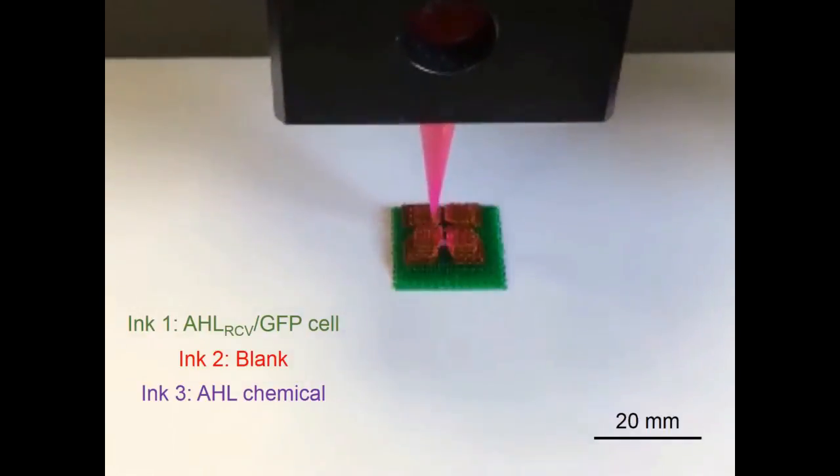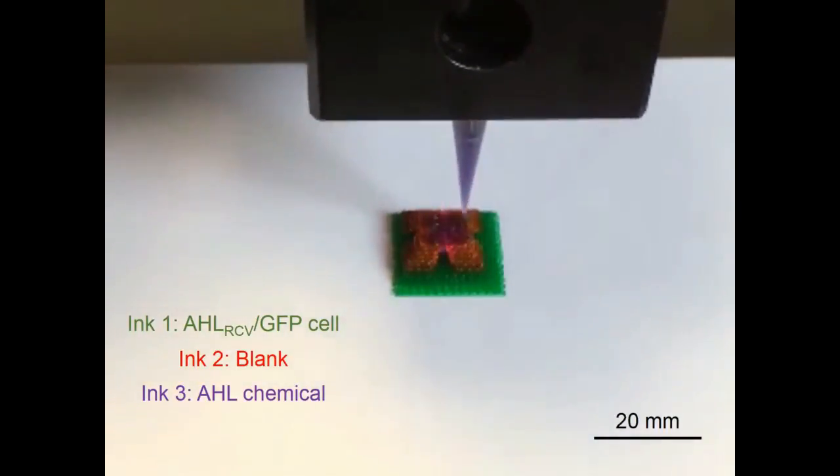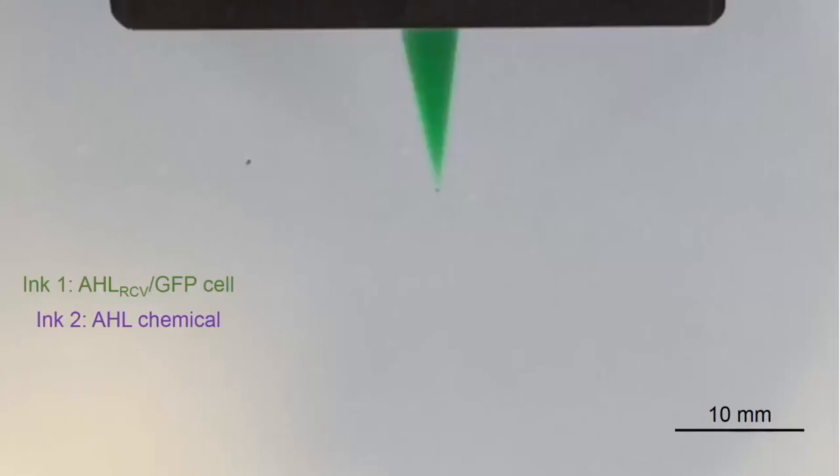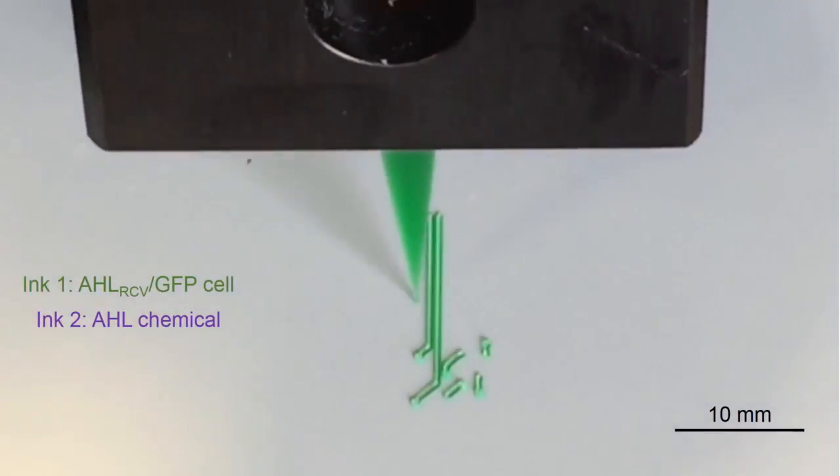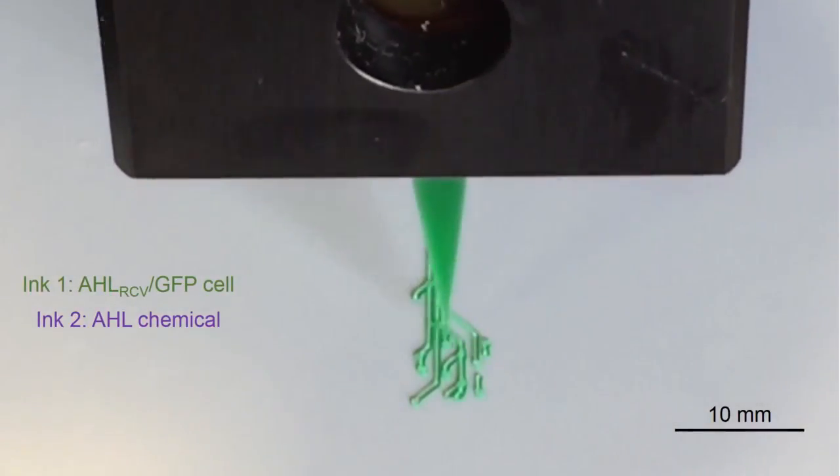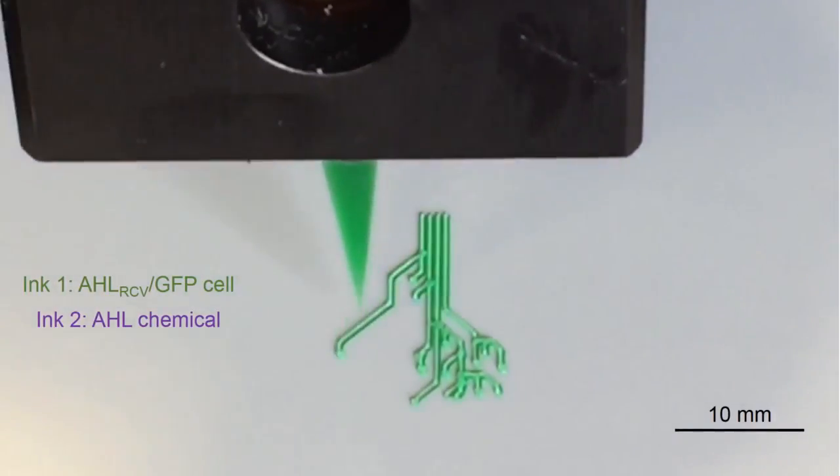To demonstrate the technique, the team printed a pattern of hydrogel with cells in the shape of a tree on an elastomer layer. After printing, they solidified or cured the patch by exposing it to ultraviolet radiation.